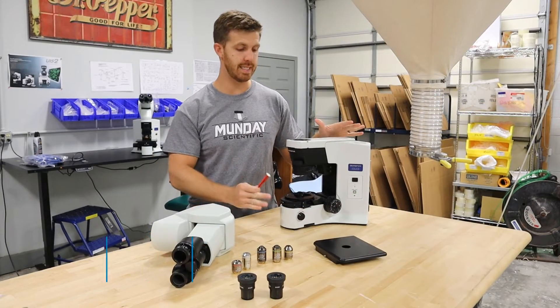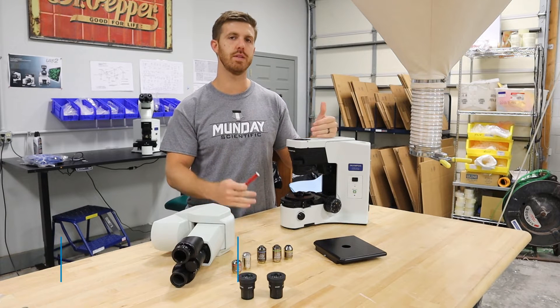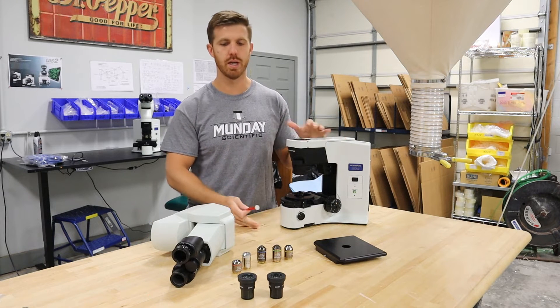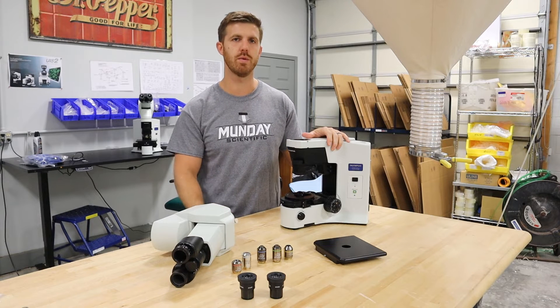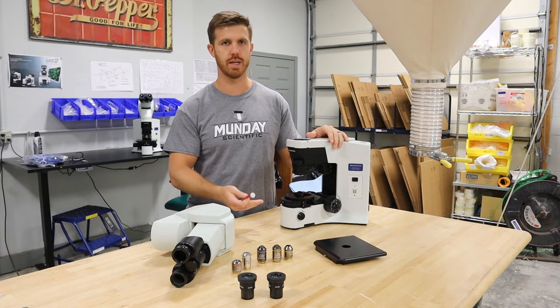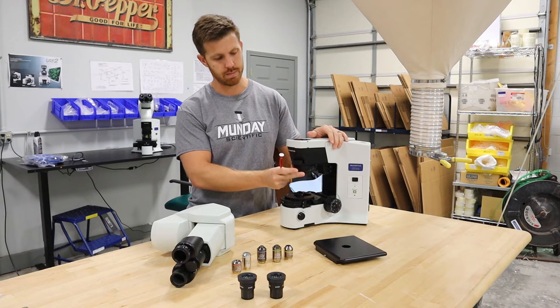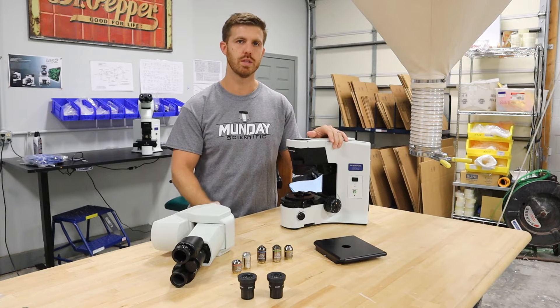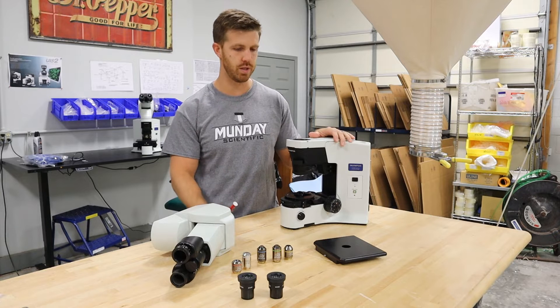We just disassembled the microscope. Now we're going to show how to reassemble it, so if you just received this piece of equipment from us, it'll be easier for you to put it together. There are other videos we have that show you the BX-41 and similar models. On this one, the nose piece doesn't remove — that's the main difference people struggle with — so I'll show you how to screw on the objectives and the process to do it.